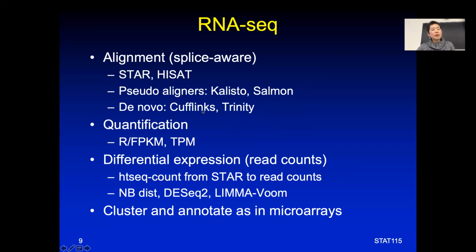I want to mention, if you are using STAR, STAR alignment is still considered the most accurate. It's just a little slower. If you have the time and you really want to get a very, very accurate result, you should use STAR. STAR doesn't automatically give you a TPM. STAR will just give you a BAM file.